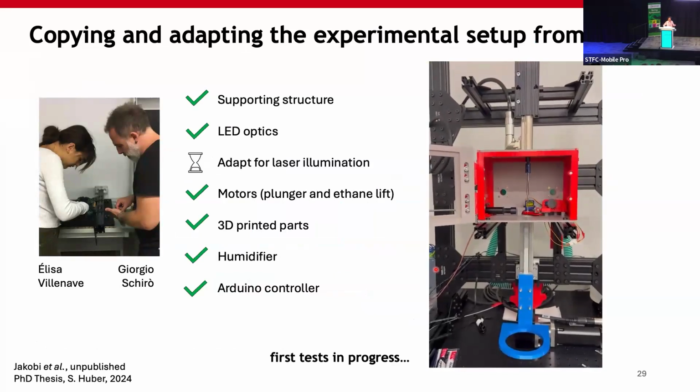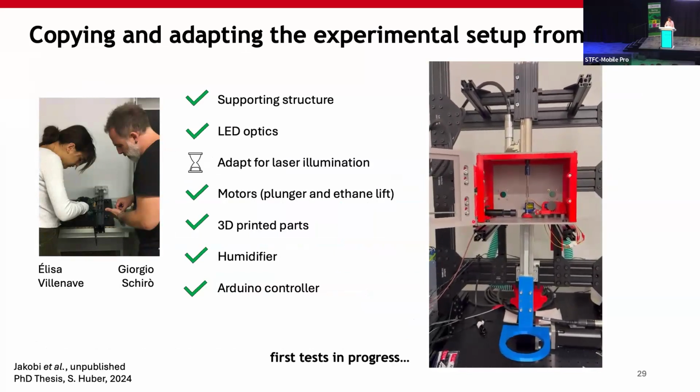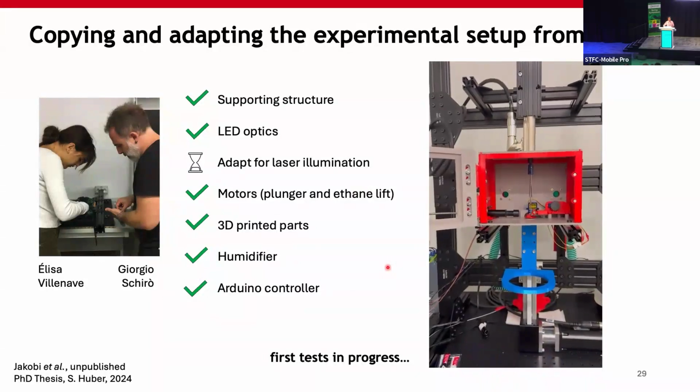It's maybe not as beautiful as the one shown this morning. It's an interesting project. I guess you will see the light flash at some point. It's also a mixture of high-tech and low-tech technology, with a very fast and precisely controlled plunger motor and then 3D printed parts.